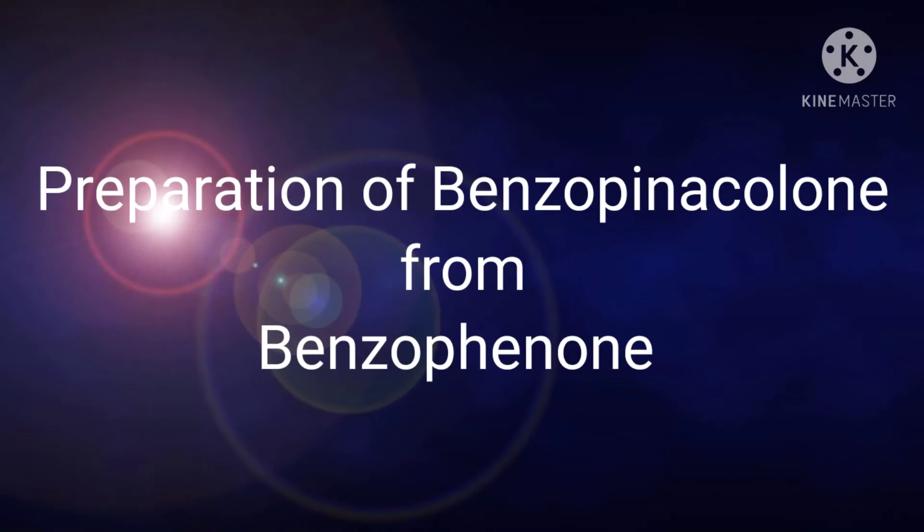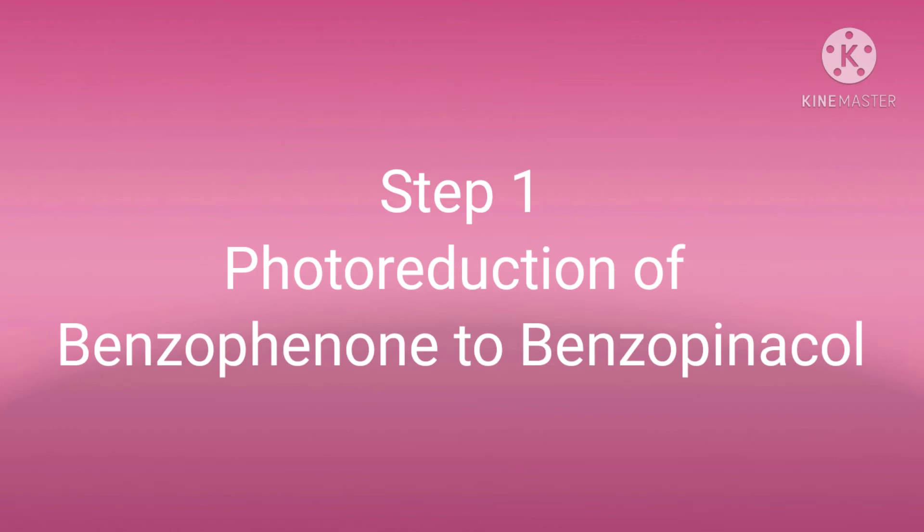Preparation of benzopinacolone from benzophenone. This reaction involves two steps.